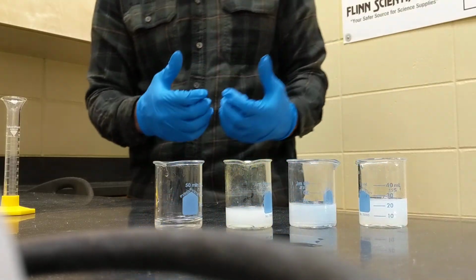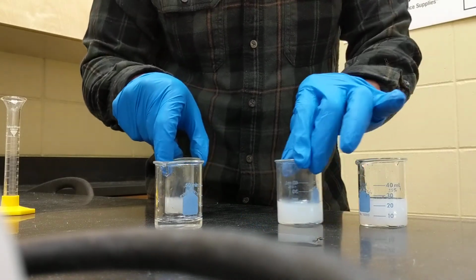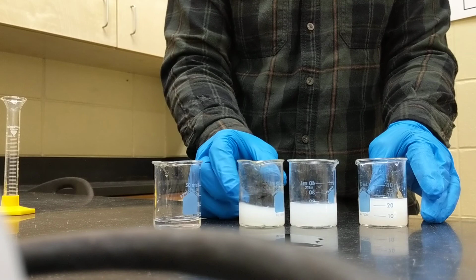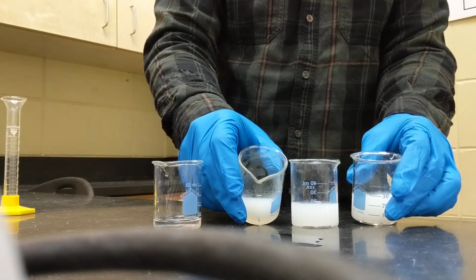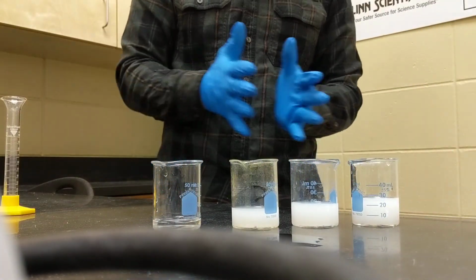Now, because this is all about chemical kinetics, you're going to stop this one and stop the other ones as soon as it becomes cloudy to the point where you can't see the bottom X. So it's hard to see when it's tilted, but hopefully you can see that it's cloudy enough that you can't see anything going on.